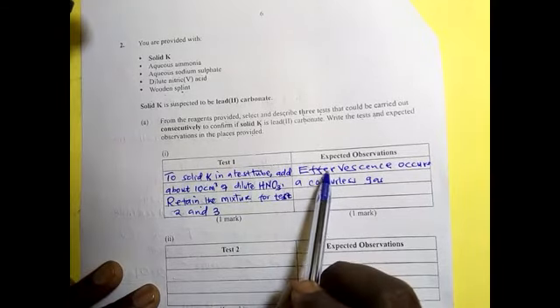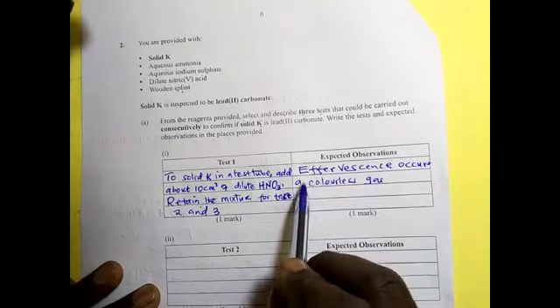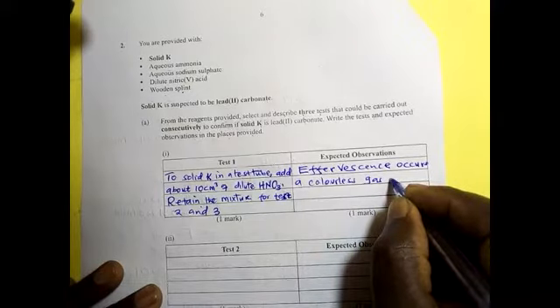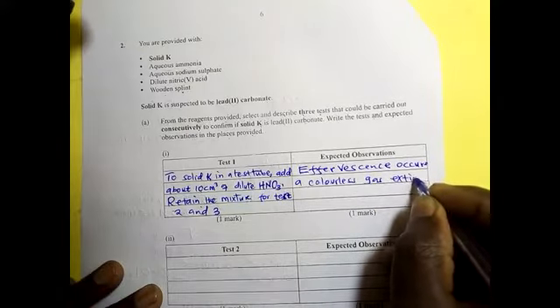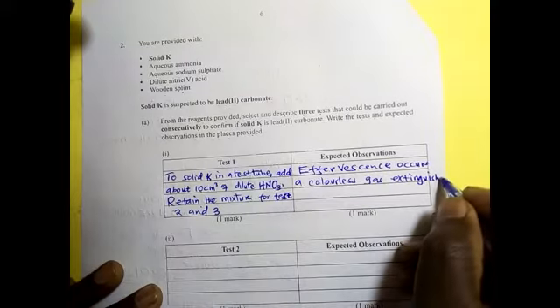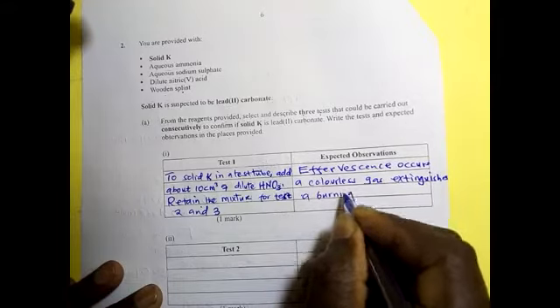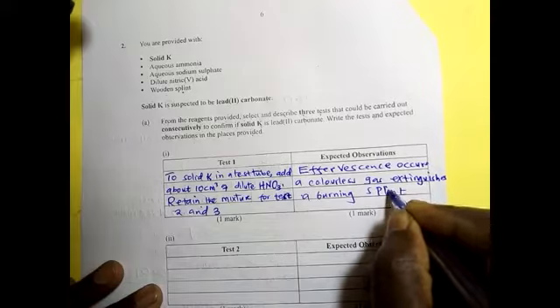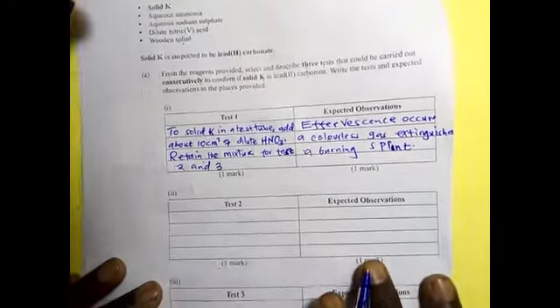If you introduce a burning splint, it will go off, it will extinguish. Therefore, a colorless gas that extinguishes a burning splint is produced.